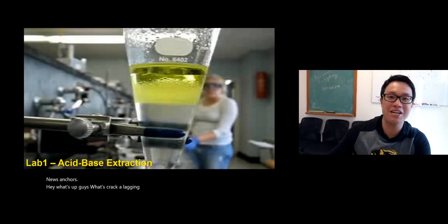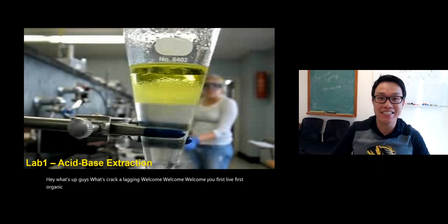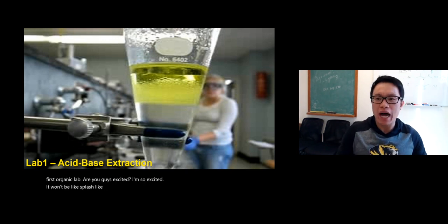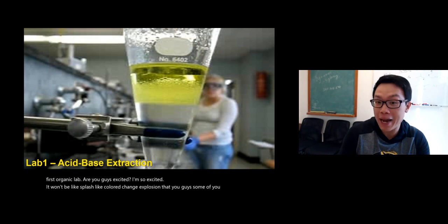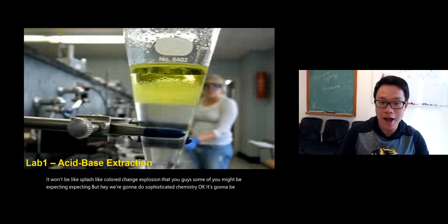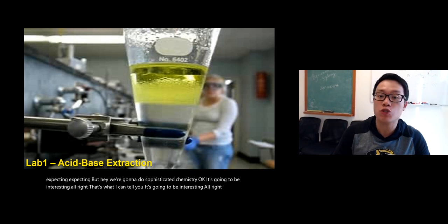Welcome, welcome, welcome. Your first lab, first organic lab. Are you guys excited? I'm so excited. It won't be like a splash, color change, explosion that some of you might be expecting. But hey, we're gonna do sophisticated chemistry. It's gonna be interesting. All right, that's what I can tell you. It's gonna be interesting. All right, lab one, acid-base extraction.